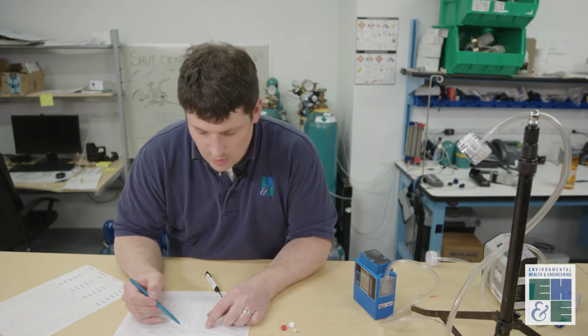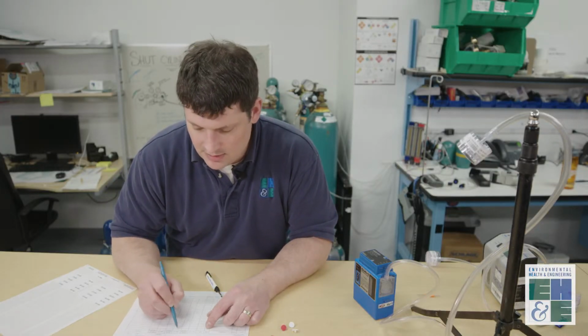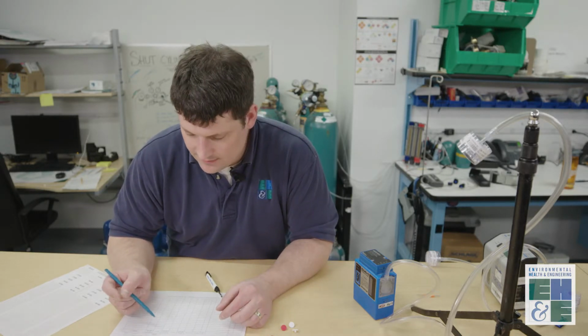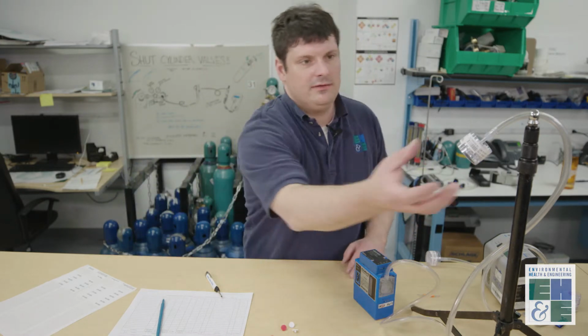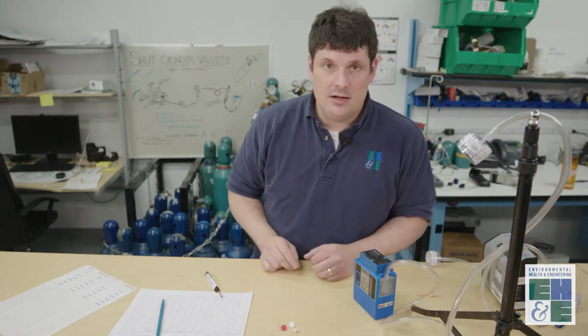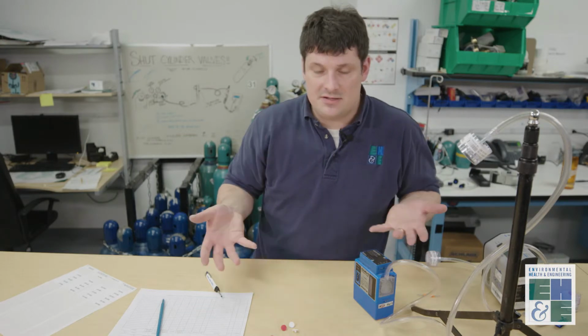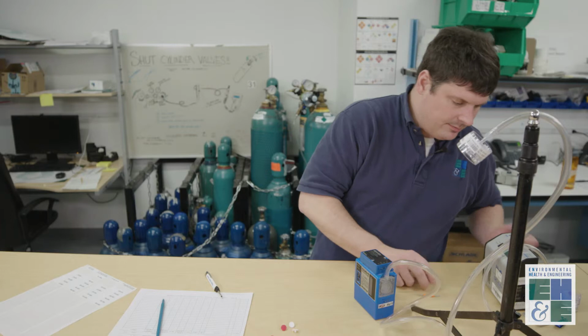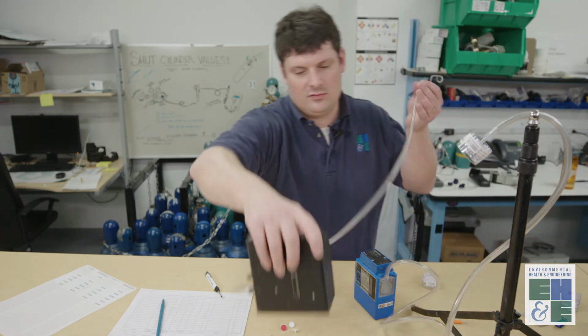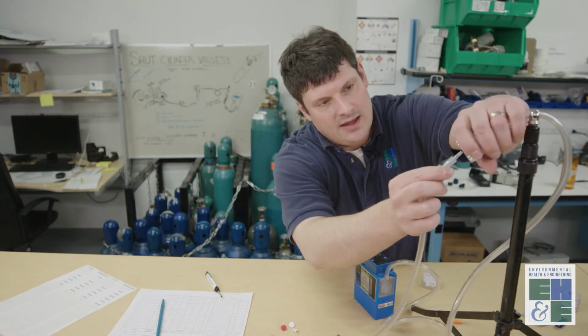We'll record the flow on, rotometer read on. We'll record the time on, and we're done. We'll record the time off and the flow off. In order to collect the flow off, we want to use the actual sample that was on the device for the duration of the time. So if we were sampling, we would turn it back on and do this as quickly as possible. We will take our off flow.